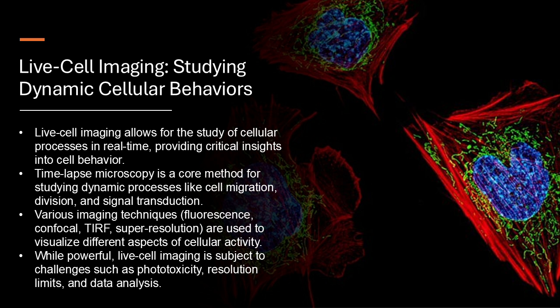Of course. And we have a category of techniques called super resolution microscopy. Super resolution. So like Superman's vision for cells. Yeah, kinda. Super resolution microscopy allows us to break the limits of traditional light microscopy and see even tinier details within living cells. We're talking about structures on the nanoscale. Wow, that's smaller than the wavelength of light.